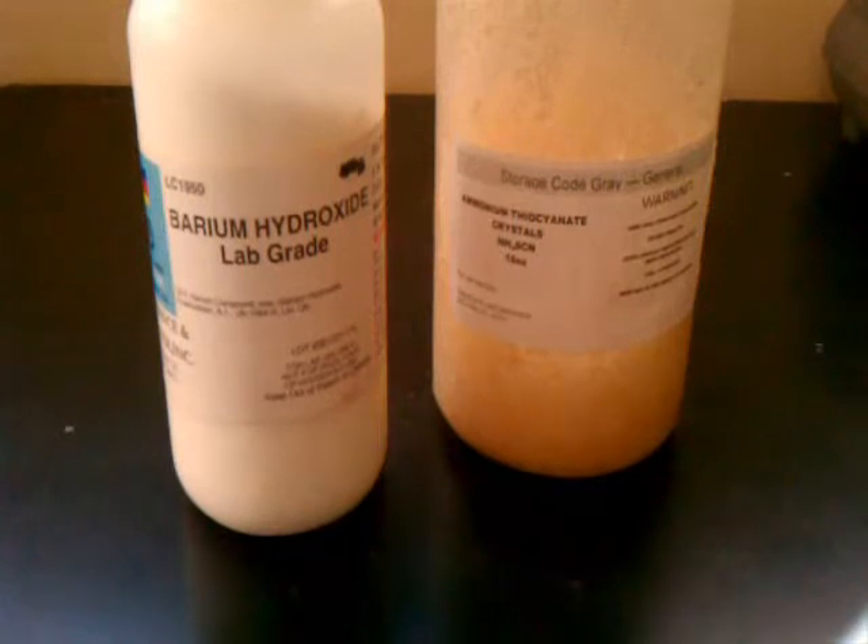The temperature that this reaction can reach is many times colder than what you would get from just dissolving ammonium nitrate into water. We are going to look at these two reactions and compare the temperatures to show you the big difference between the endothermic reactions of ammonium nitrate and ammonium thiocyanate.